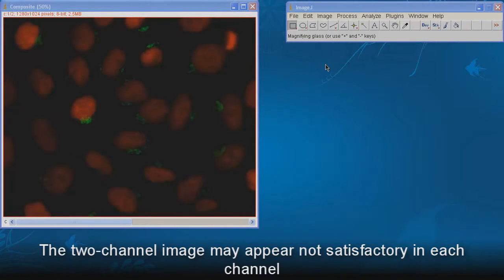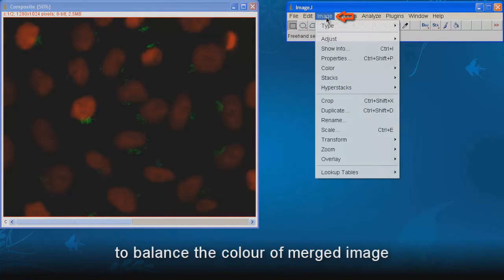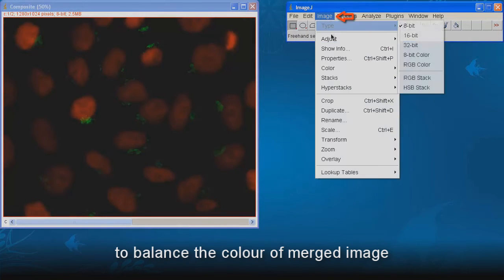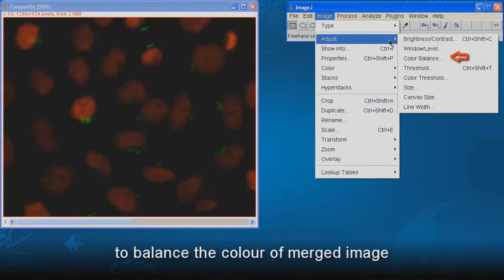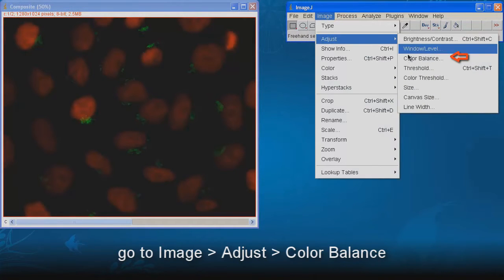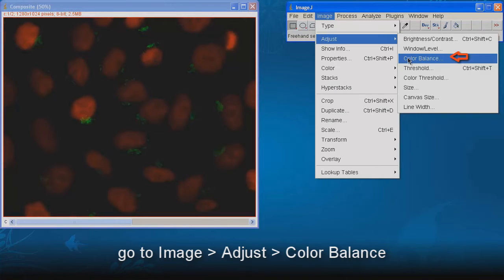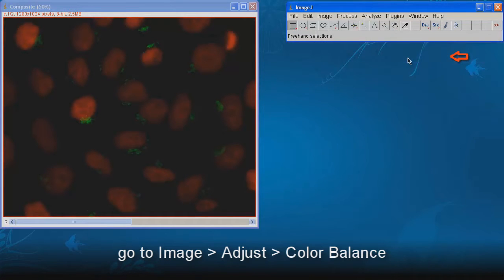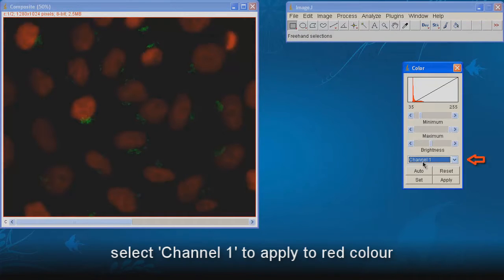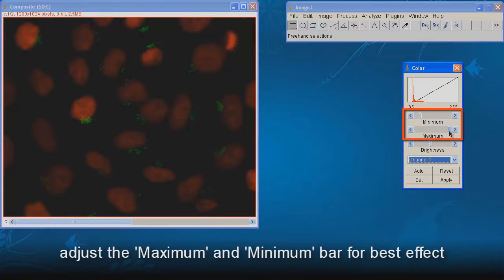The two channel image may appear not satisfactory in each channel. To balance the color of merged image, go to Image, Adjust, Color Balance. Select channel 1 to apply to red color. Adjust the maximum and minimum bar for best effect.